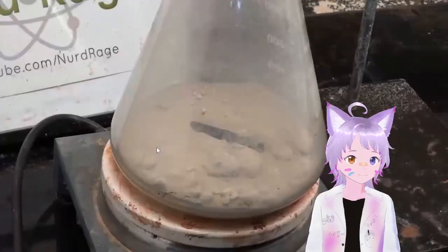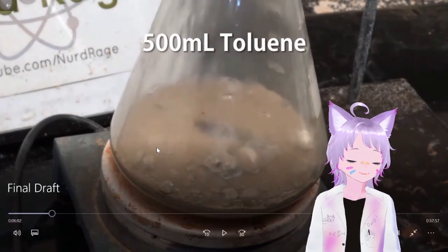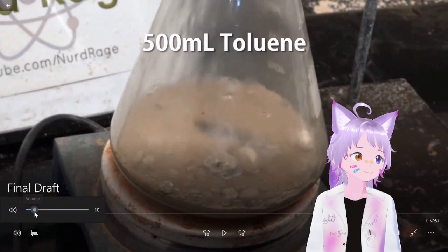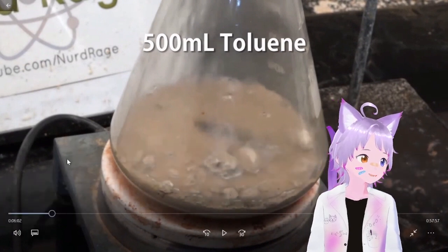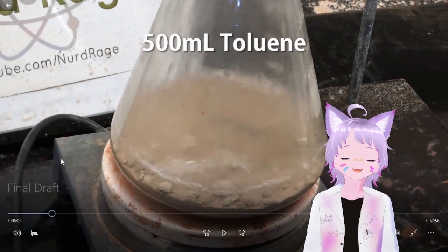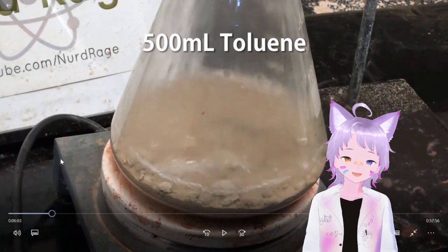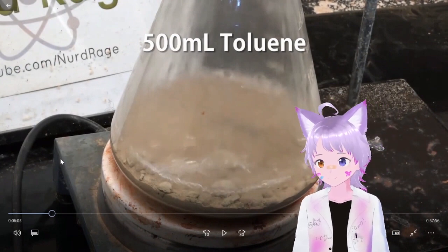Oh, anhydrous ferrous chloride's pretty easy to make. I've done it. I guess just for fun, I even decided to make the ferrous chloride with membrane electrolysis. No, I'm serious. Just for fun, I did that. It works. It's silly, though. You could just use hydrochloric acid and steel wool to make it, but I just wanted to see just how much meme power I got, you know?